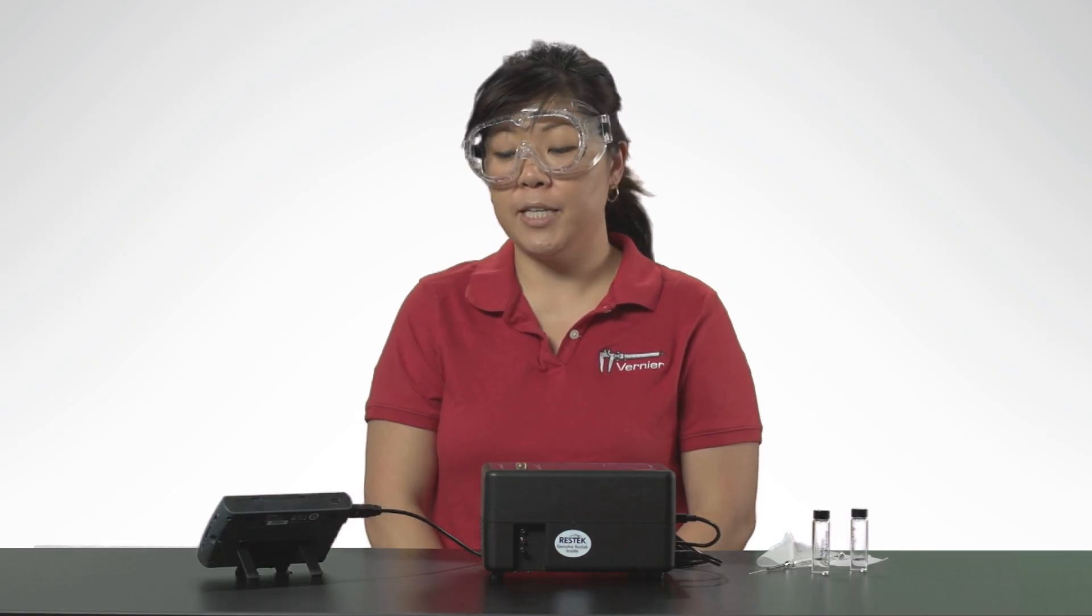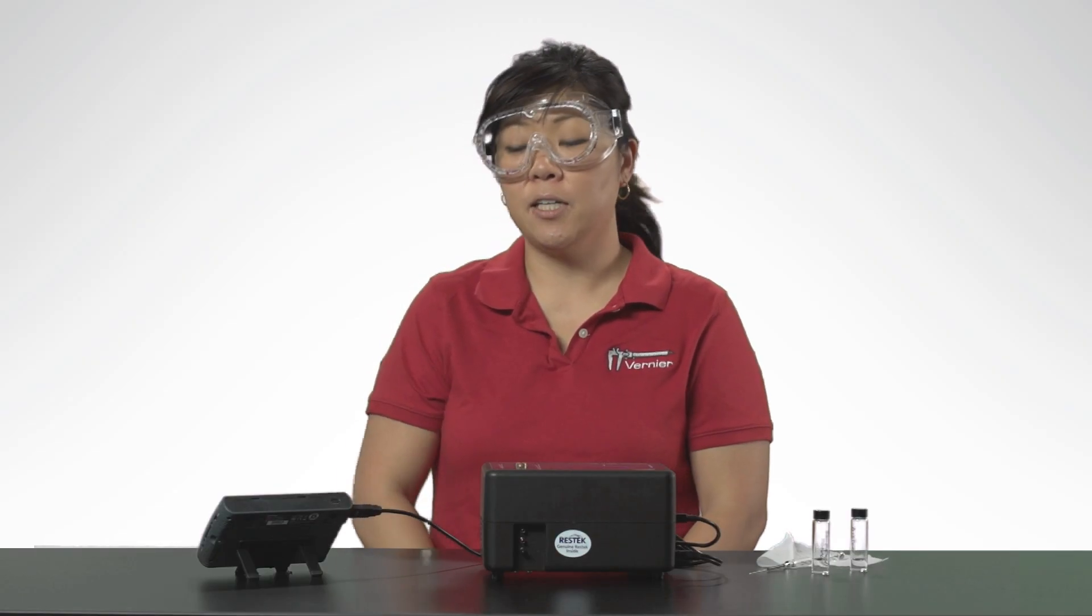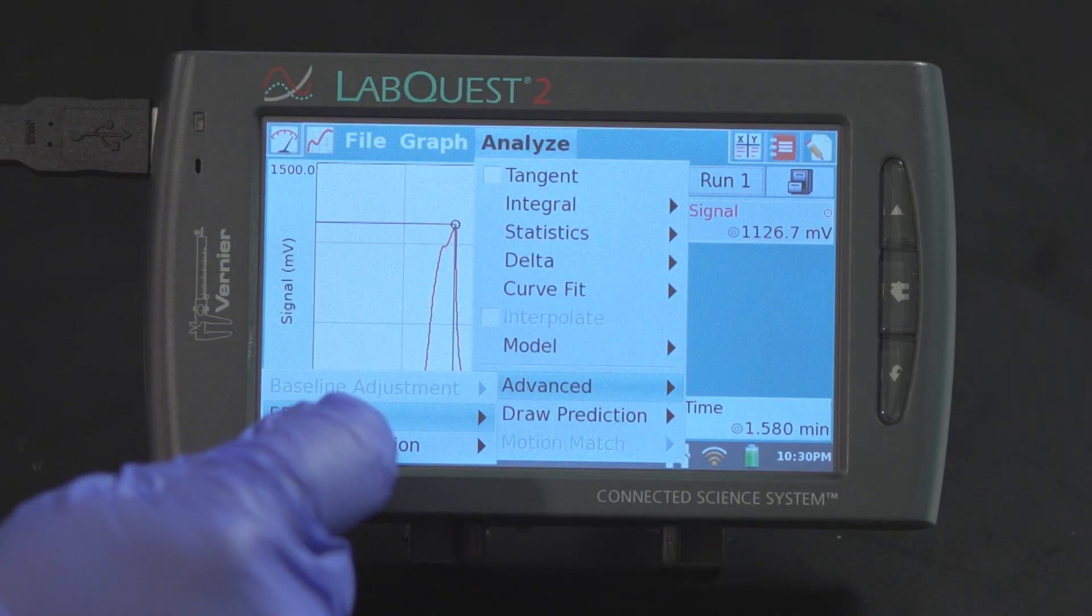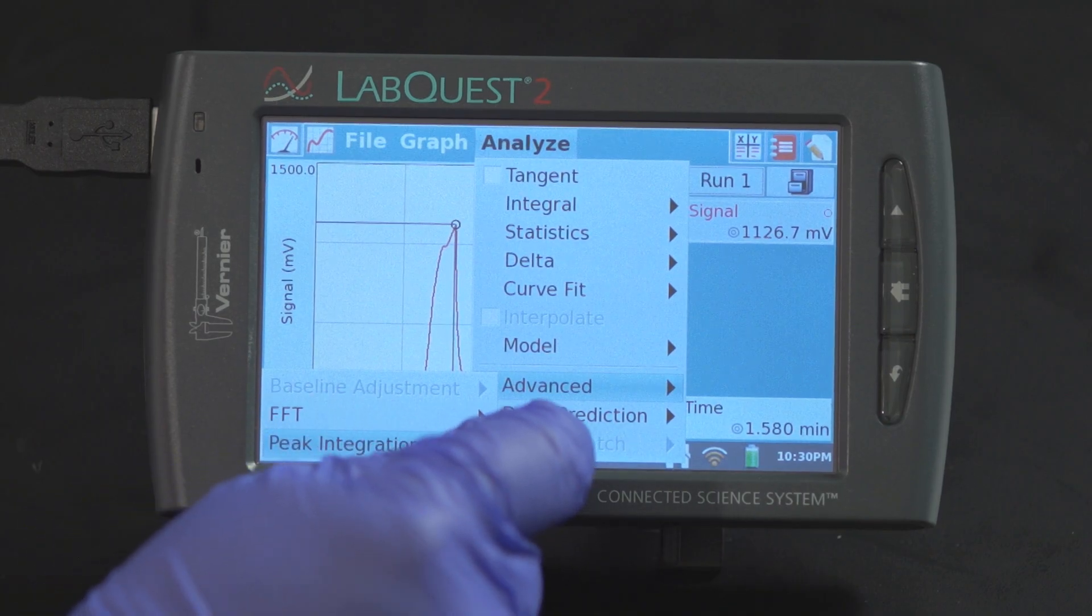Another analysis tool is peak integration. Tap on analyze, choose advanced, choose peak integration, then signal.